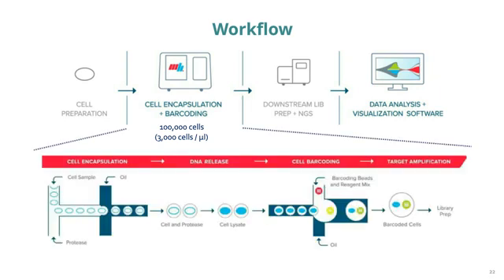So first of all, the technology is microfluidics, and the cells pass through oil emulsion and are encapsulated into droplets together with lysis buffer and proteases. The cells are lysed, and the proteases digest the DNA binding proteins so that you have access to the genomic DNA.